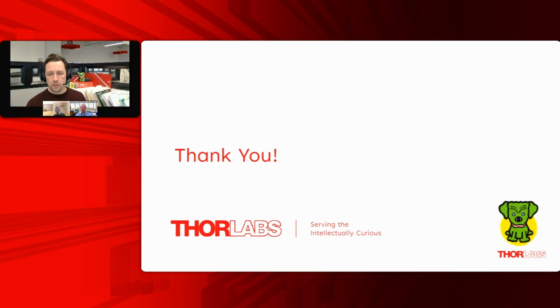Starting, going back to Sergey and the spectrometers, I'm going to start you with a multi-parter regarding time resolution. Can you comment a little bit about the limitations of the acquisition rates of the spectrometers and what the trade-offs are? And then can you make any comment on the time resolved performance compared to techniques like step scan? The listener was asking in the context of looking at a dynamic process like fast diffusion.